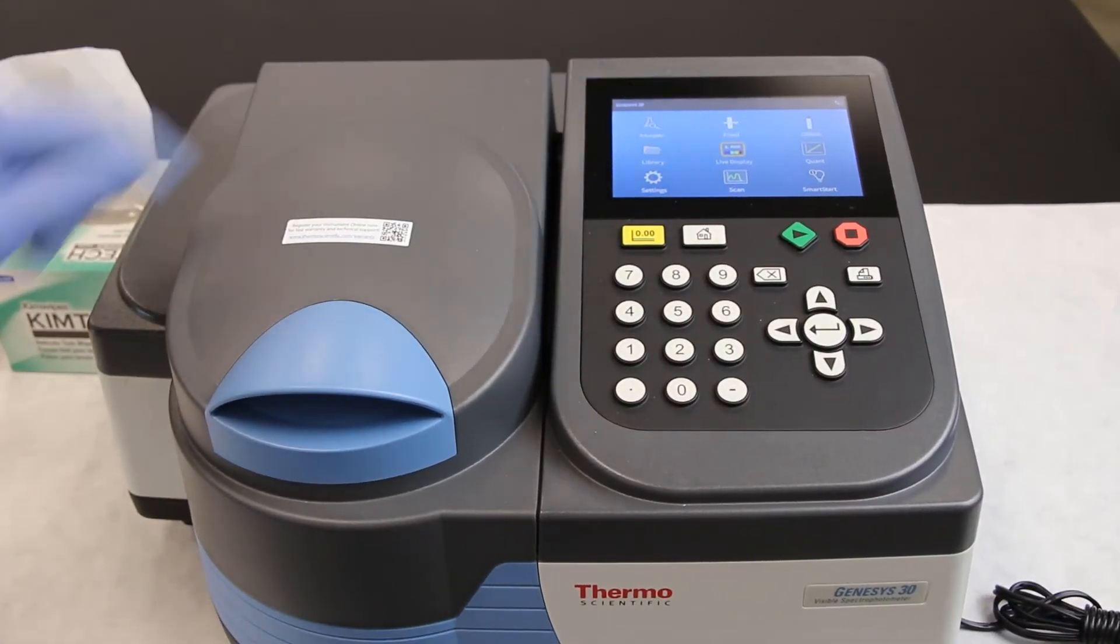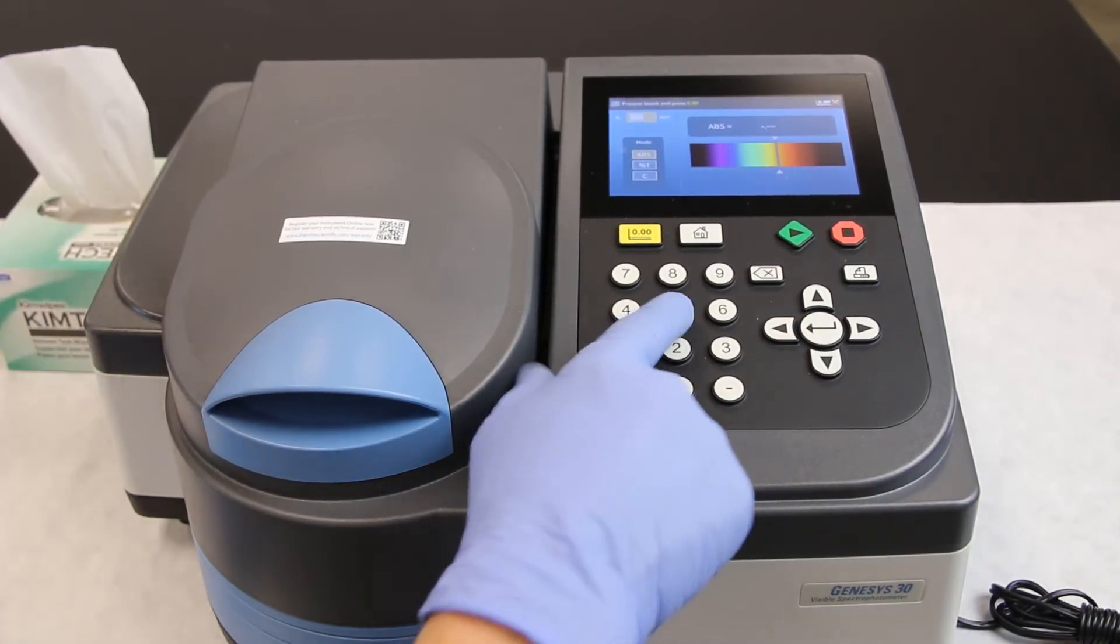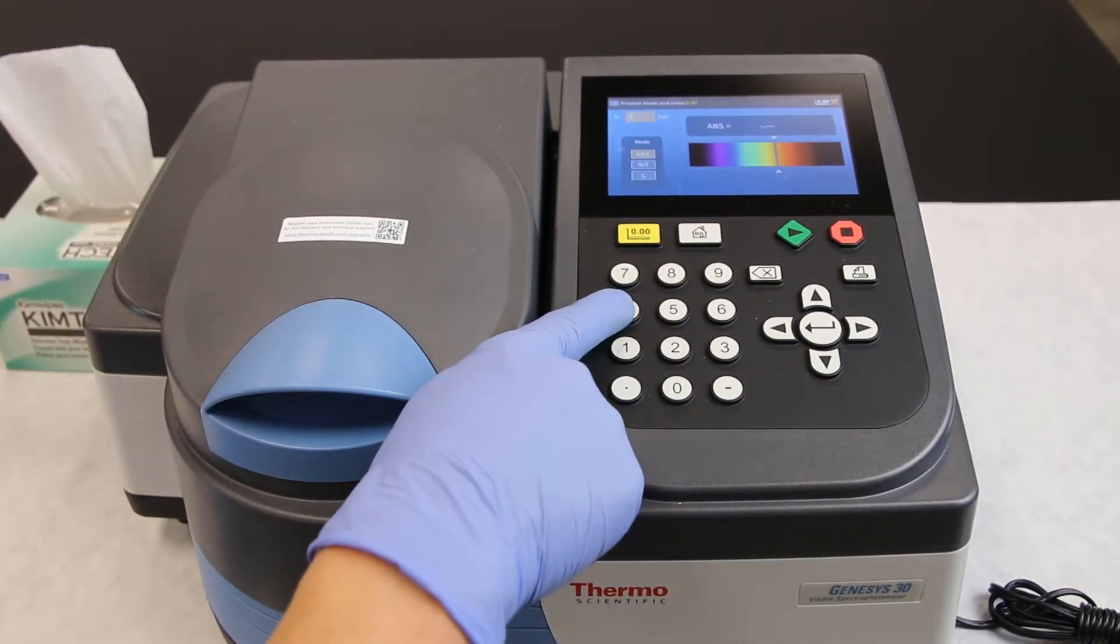Set the spectrophotometer to 540 nm, because this is the optimal absorbance of sugars reduced by DNS.